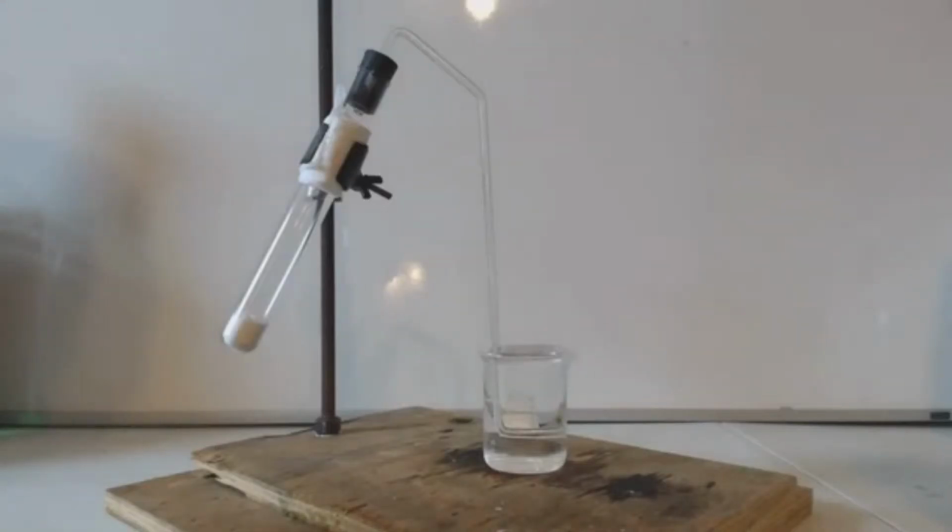Alright, I want you to see inside the test tube I have baking soda, or sodium bicarbonate. In this thing here, I have a saturated solution of calcium hydroxide. And this is how you test for carbon dioxide, by the way. I'm going to heat this up, and it's going to release carbon dioxide into there.